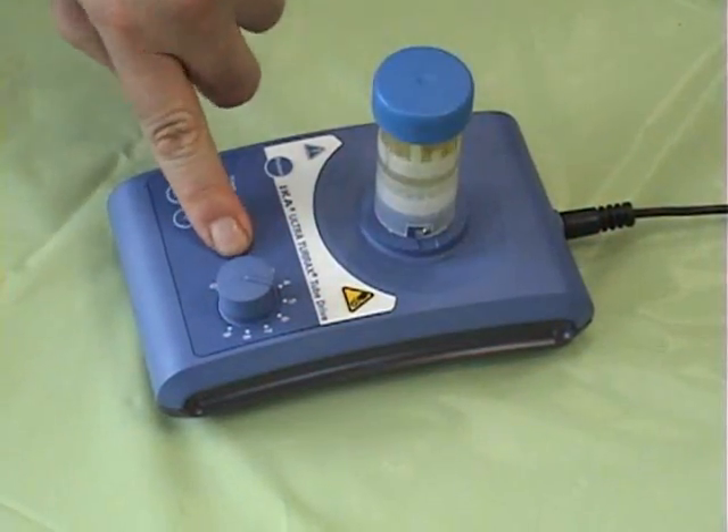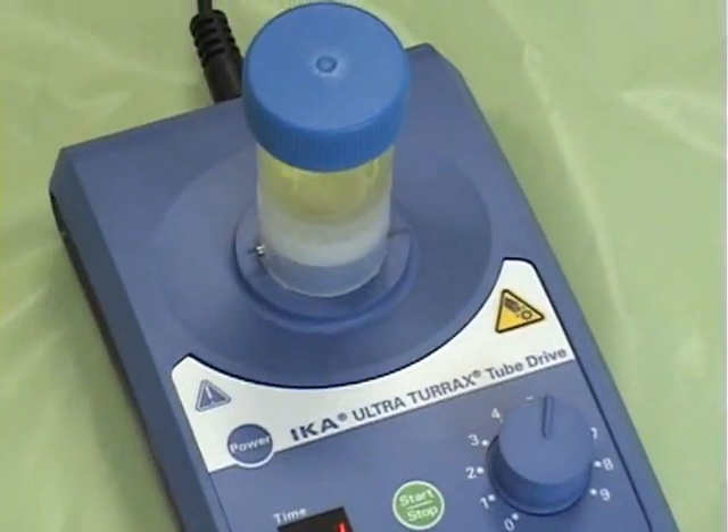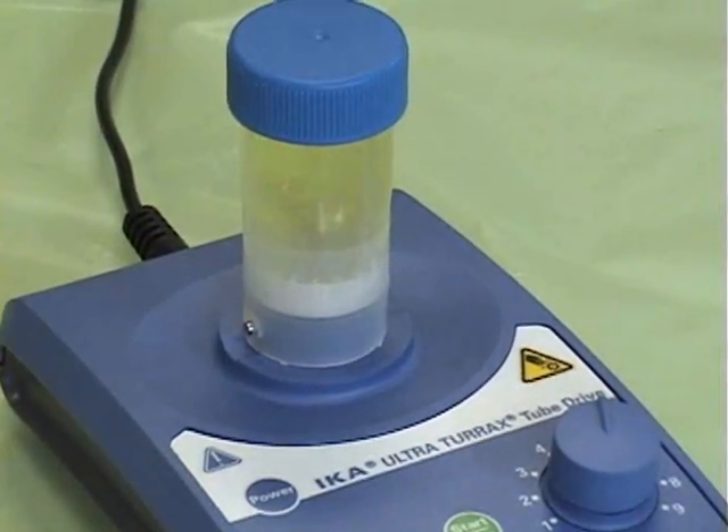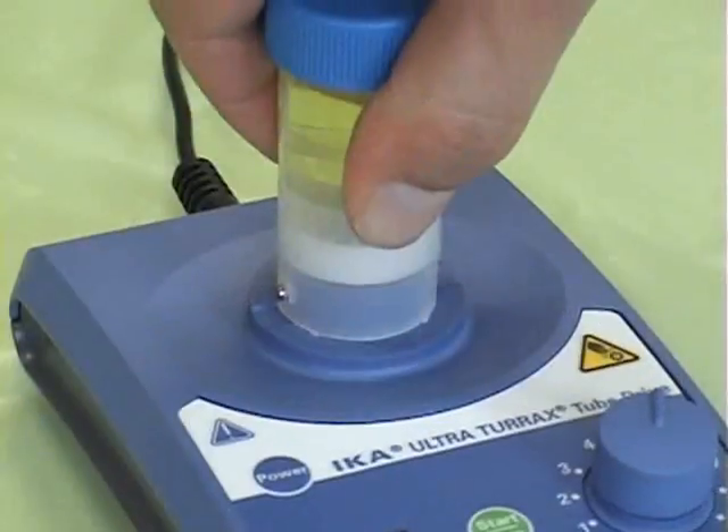The IKA Ultra Turrax tube drive homogenizer allows for powerful homogenization of small samples without the problem of cross-contamination and generator cleaning.